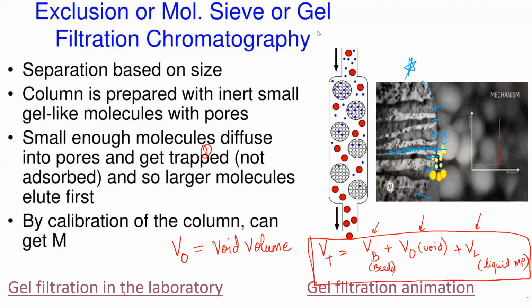Size, Anushka. Yeah, correct. So who comes out first? The larger molecules or the smaller molecules? Who comes out first? Smaller molecules come out first, says Prarthana. Smaller molecules stay inside the beads. The larger comes out first. Yeah, the larger ones come out first.